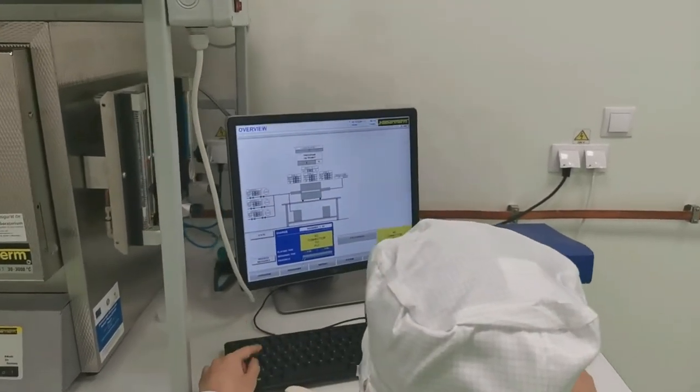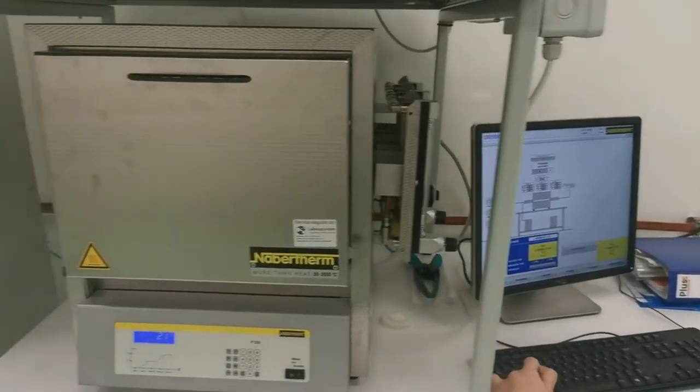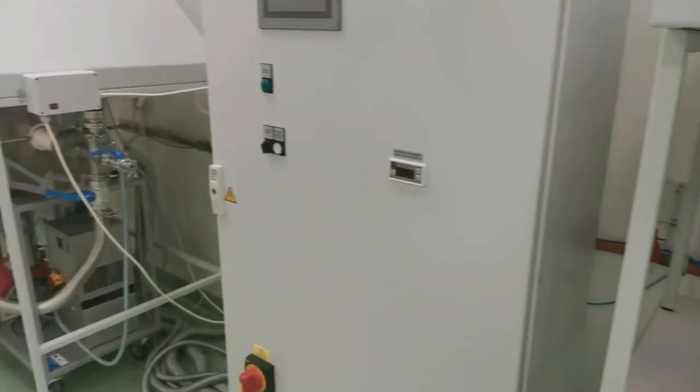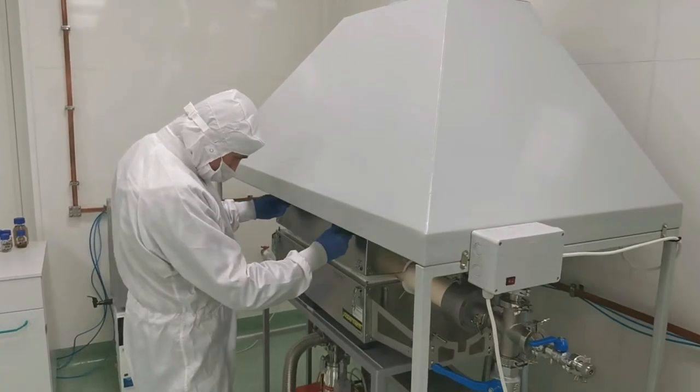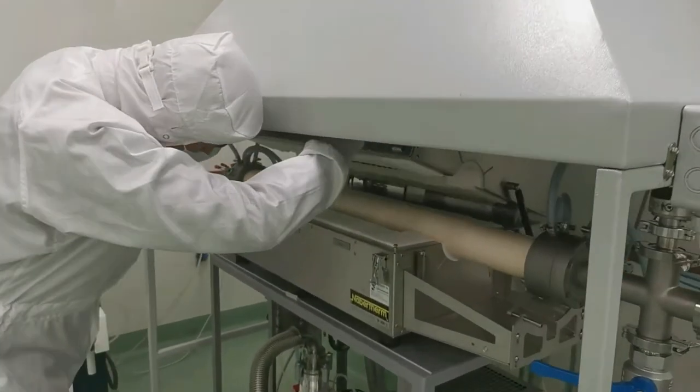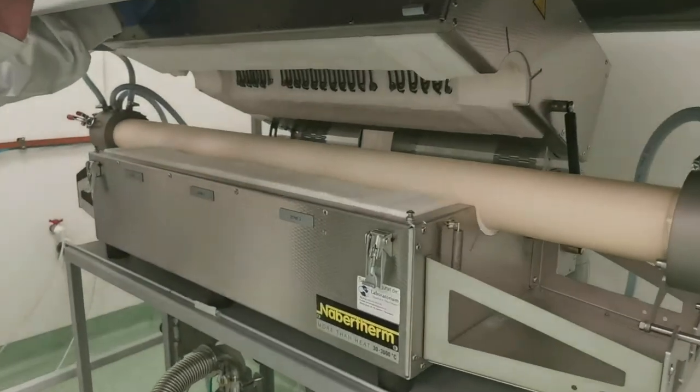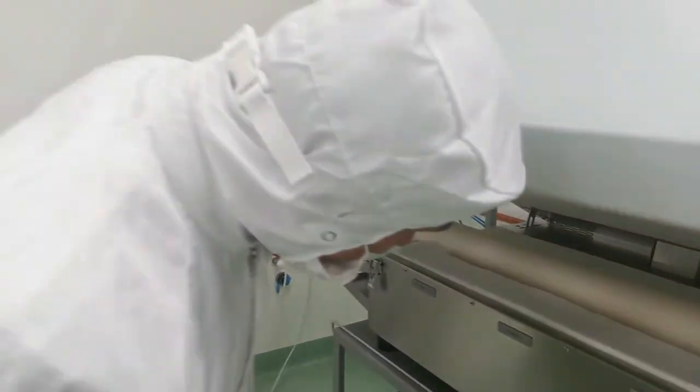The second available oven is a tubular furnace which, similar to the calcination oven, can be used to perform thermal treatments up to 1300 degrees under air or controlled atmosphere but also under vacuum, down to 10 to the minus 5 millibar.